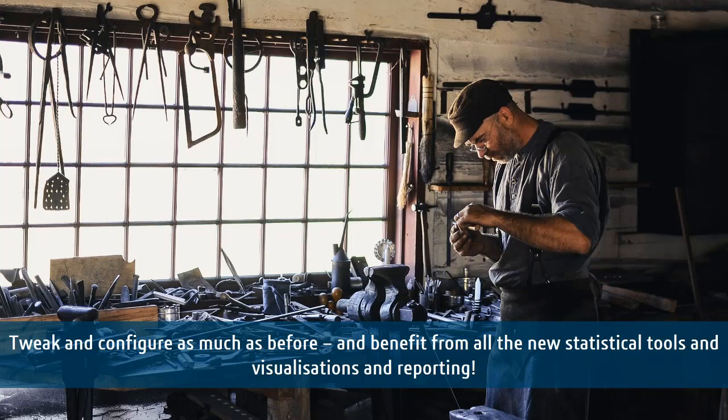So you can add your own automatic invalidation at the quality control step. You can add your own automatic invalidation of sample results. You can add your own automatic selection of hits at the sample results, and you can create your own reports that will be created at the end of each run.